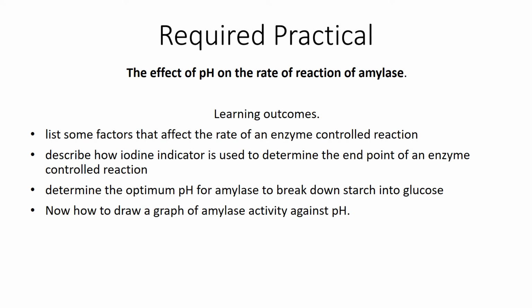Hello Year 10, and we are now looking at the effects of pH on the rate of reaction of amylase. If you recall, amylase is a digestive enzyme, and therefore we need to pull on quite a lot of information for this practical. It will be testing those higher skills, stretching those of you aiming for a 7, 8, 9, and it will also push those of you doing the foundation paper to see whether or not you're a 4 or a 5.